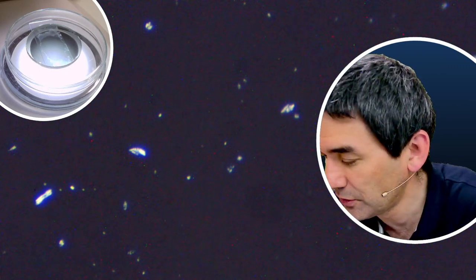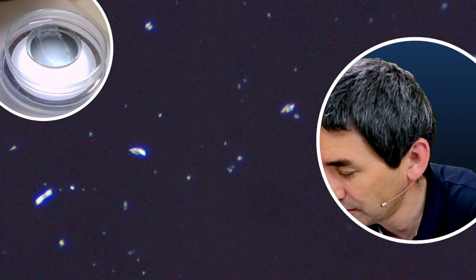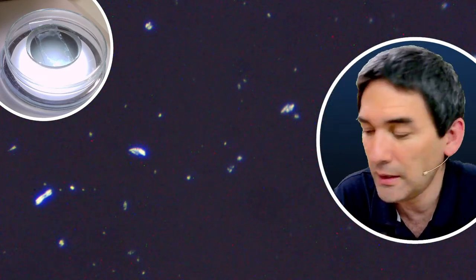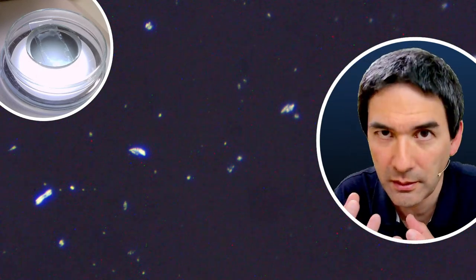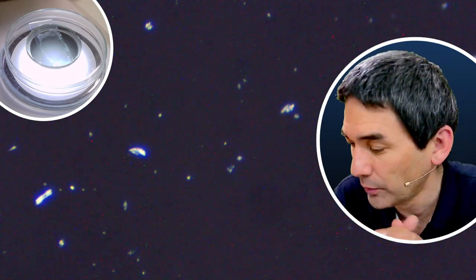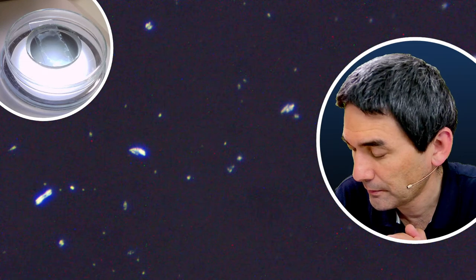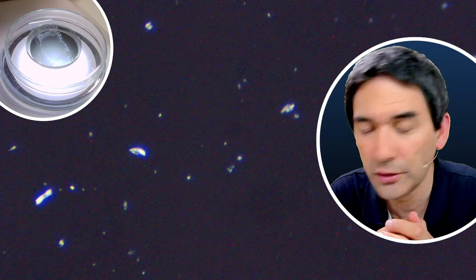But I'm not going to touch this because I actually want to see it again. But again, it could be maybe that because I put a petri dish over the slide, the air beneath the petri dish becomes saturated with alcohol, and therefore it takes a longer time for the crystals to form. See, something seems to be happening now, so I'm not going to touch this.